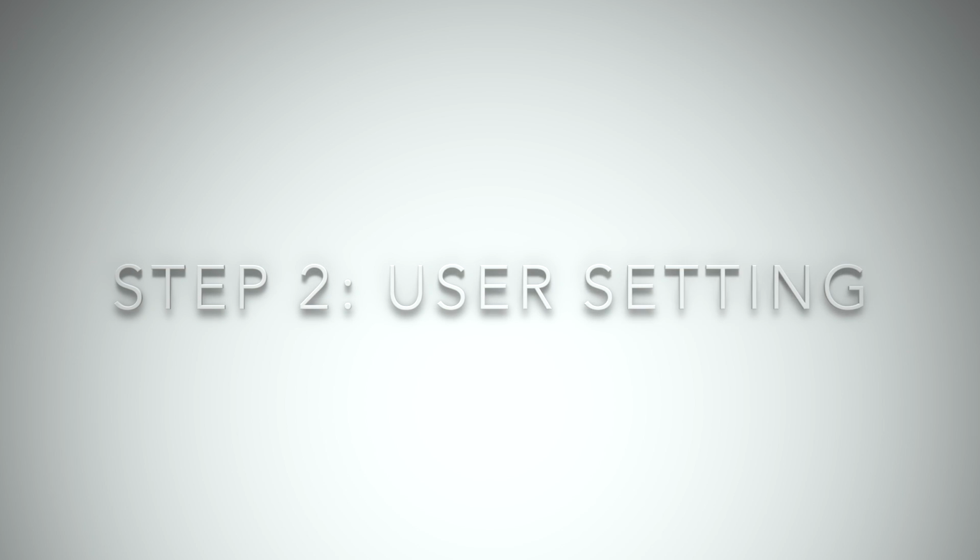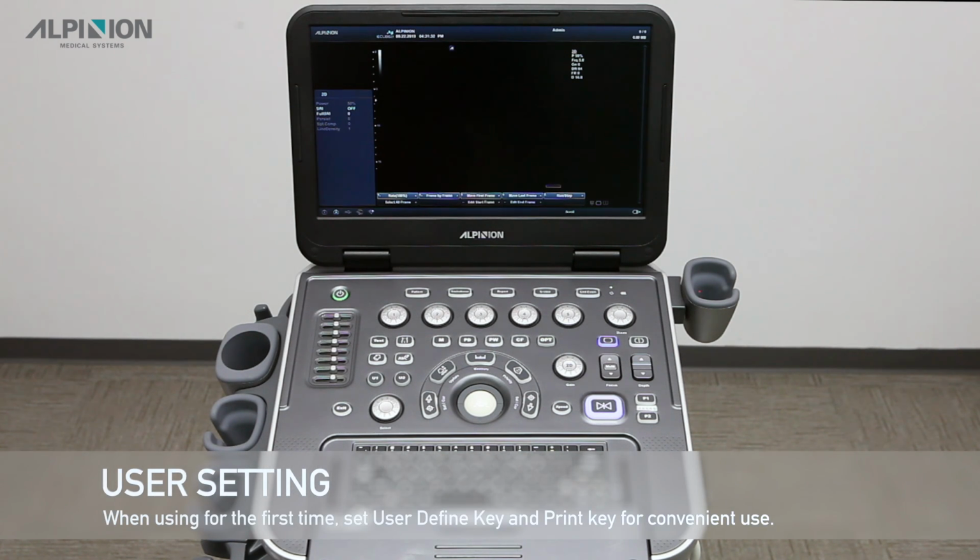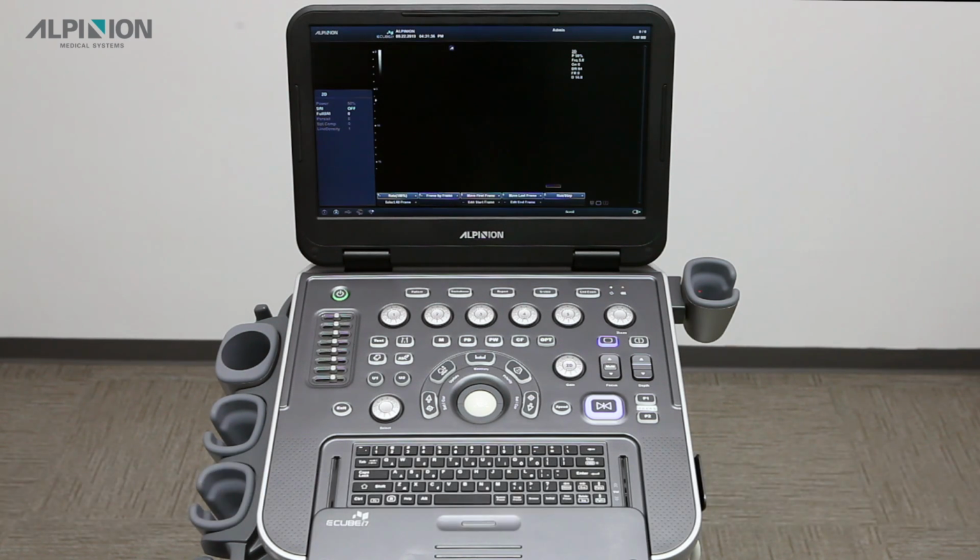Step 2. User Setting. When using for the first time, set User-Defined Key and Print Key for convenient use.